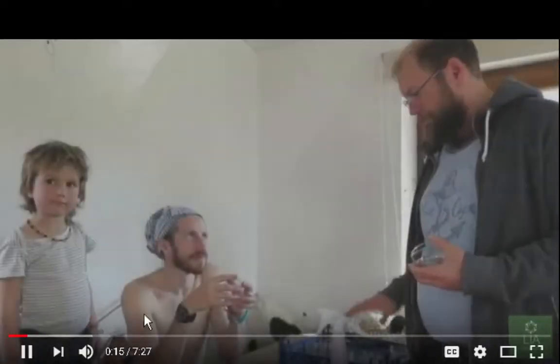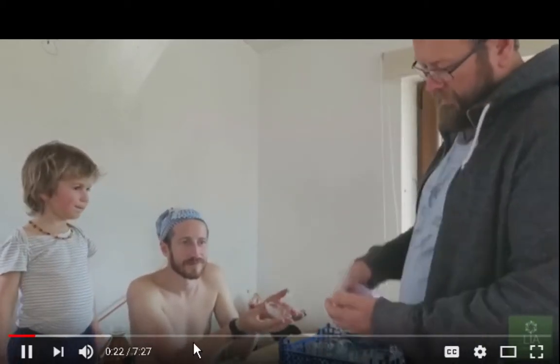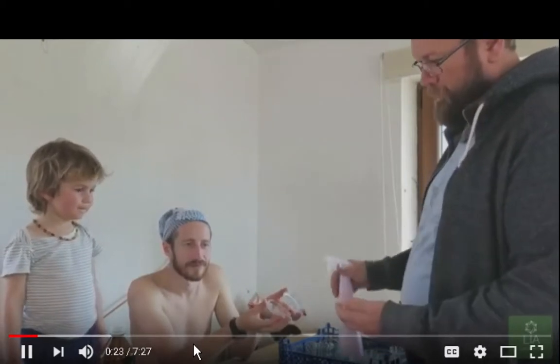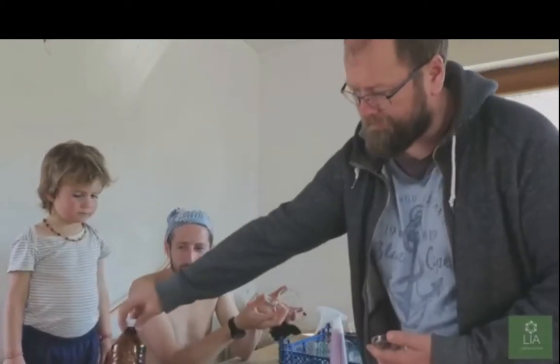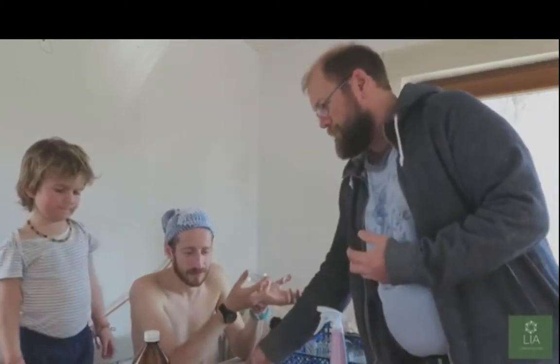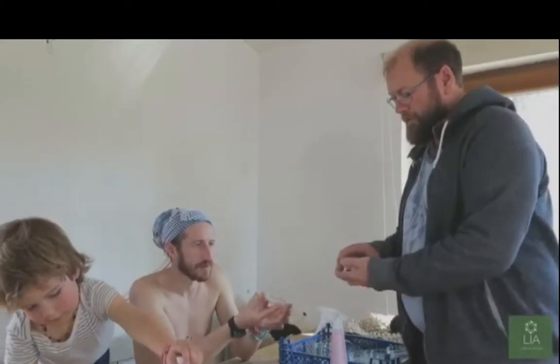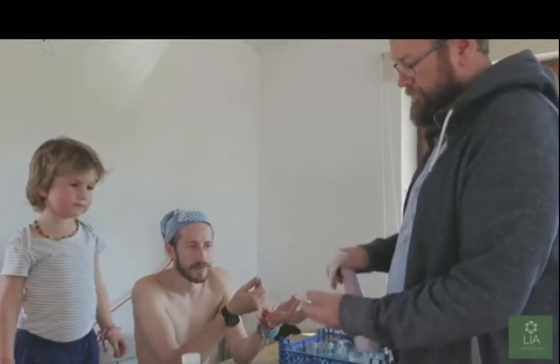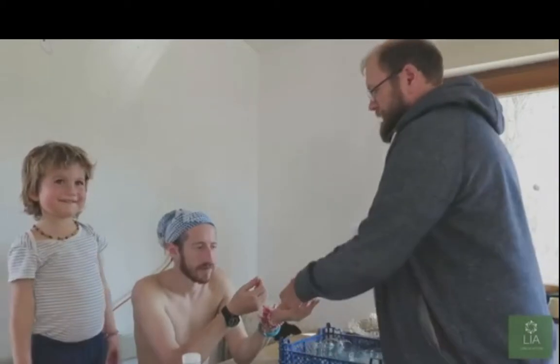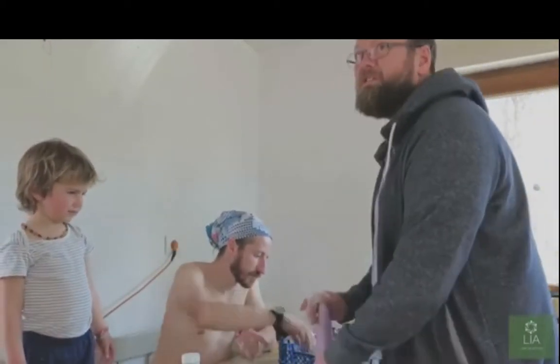So here we are, about to prepare the Petri dishes. I don't know if that really matters. What we're doing is giving each Petri dish, the lid and the base, a slight spray with alcohol. This is 95% ethanol. This will just make sure that there are no contaminations in there, so that when we apply the agar to the dish, it will last a little bit longer. It won't get any contaminations. So this is a little bit of a cheat.